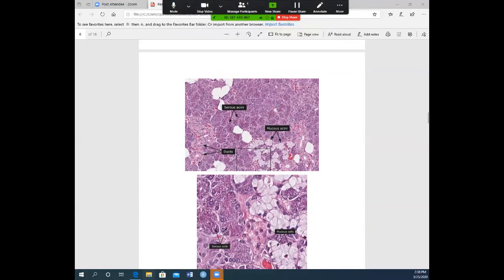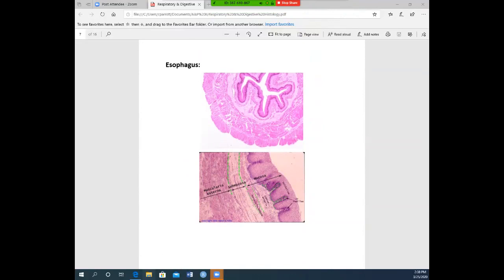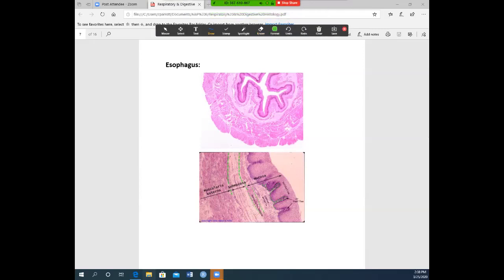Now we're done with respiratory and moving into digestive — salivary glands are actually part of the digestive system. Next is the esophagus. The top picture is zoomed out, showing the lumen — the inside opening space of the esophagus. This is an esophagus not in the process of swallowing food, so it is collapsed down on itself; when it swallows it will expand to allow food to pass through.